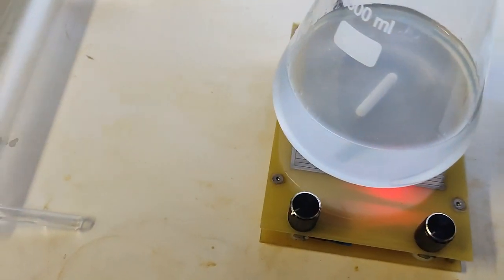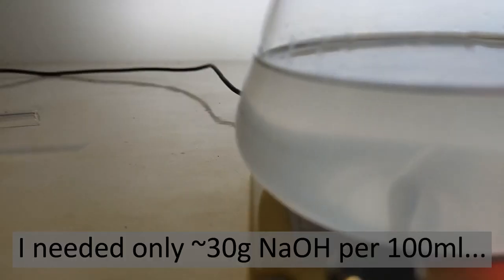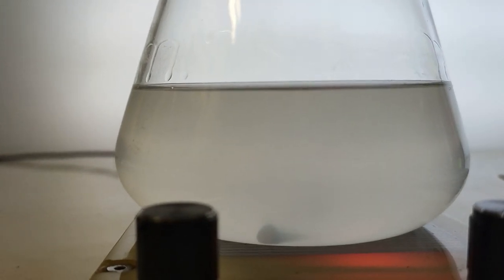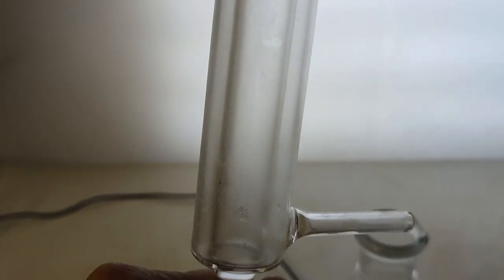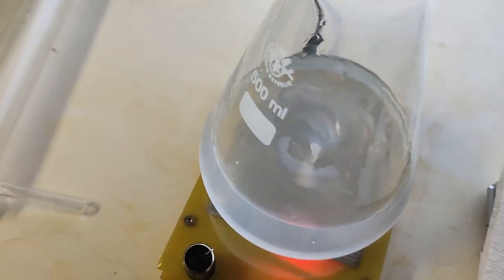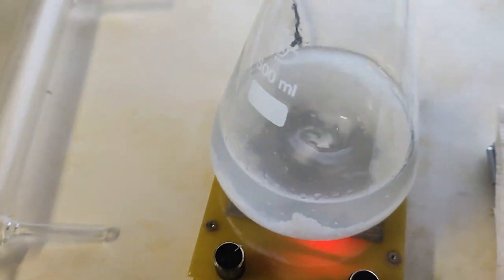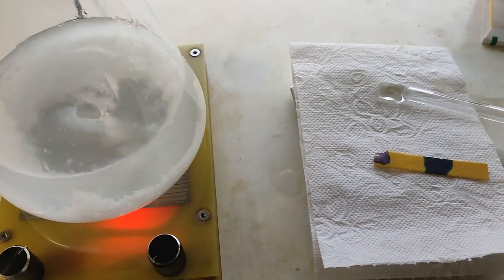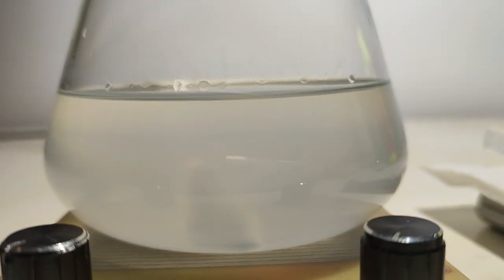You know what, I'm like 5 minutes in and I don't see any layers. And oops, this is still strongly alkaline. Well, I don't think I lost a bunch during reflux, even though the condenser is quite cold. This is not very great, because why am I adding hydroxide since this is still alkaline as hell? Well, one will never know. Fuck. I think I'm screwing up a lot. Okay, let this sit for a while in cold and dark.